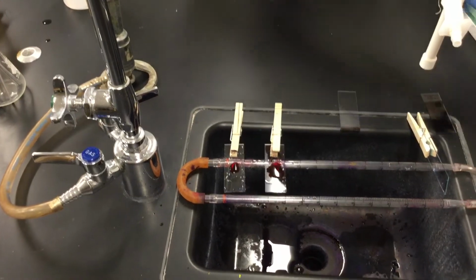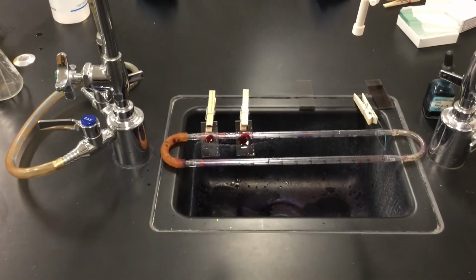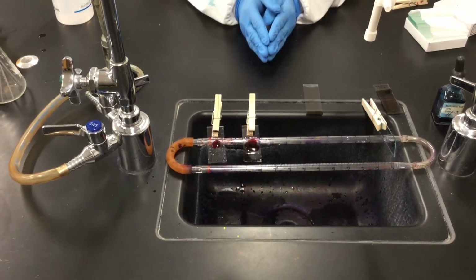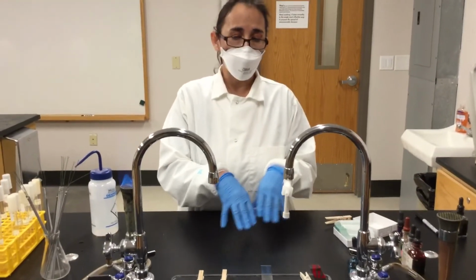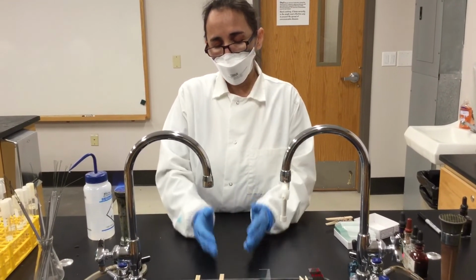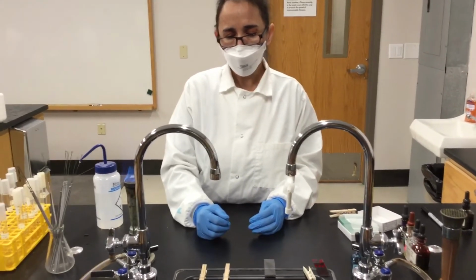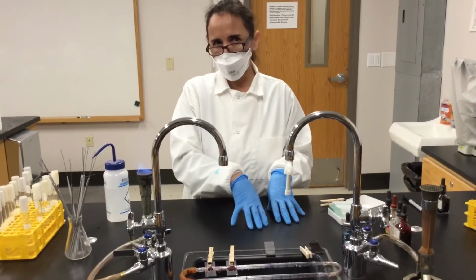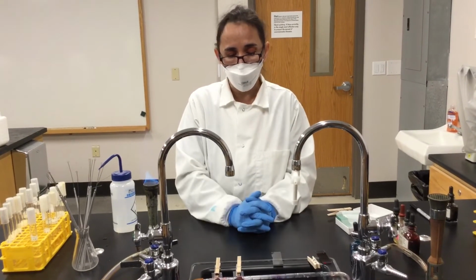Okay, so while I wait for this last part of the gram staining to go, gram-positive bacteria stain purple and gram-negative stain red. So when you add your crystal violet, which is the primary stain, you introduce this into both gram-positive bacteria and gram-negative bacteria. So this dye stains the cytoplasm of both.